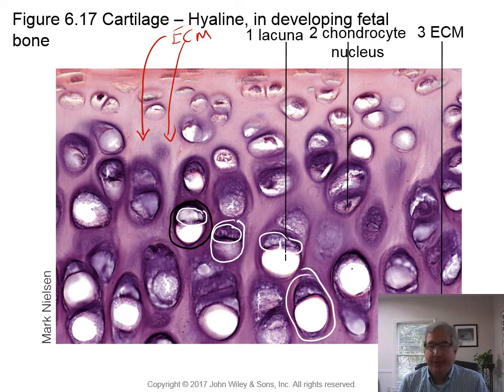Right? And it's hard to see fibers in there. You look at it and you're like, well, maybe there are some fibers in there. In this picture, it does look like there's a little bit of fibers. Usually it just looks really smooth, really glassy. You can't see anything. Okay? And here's more. All these spaces between are all the extracellular matrix here. Okay? All right, next slide.